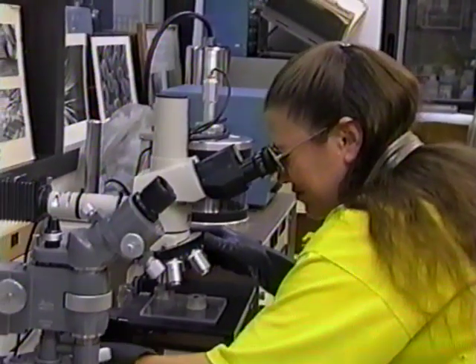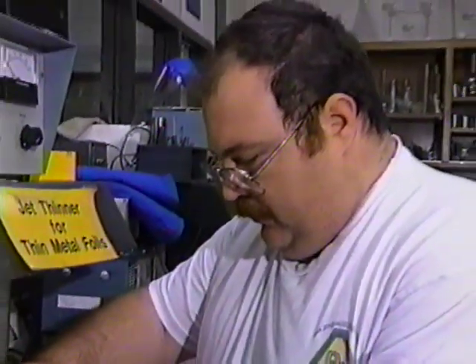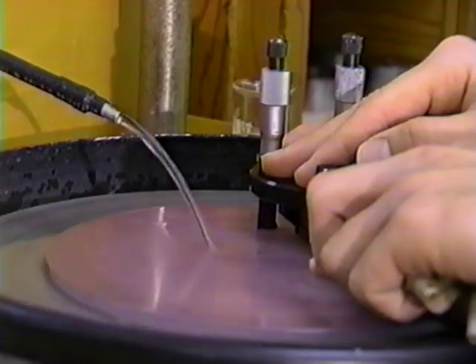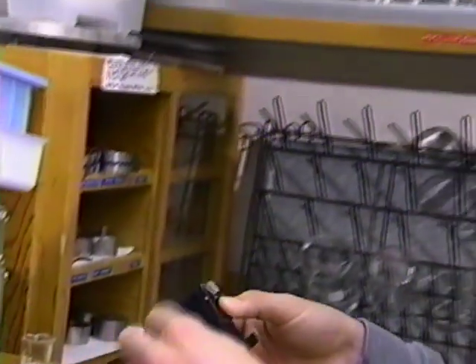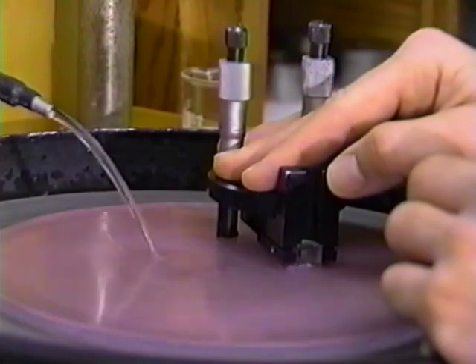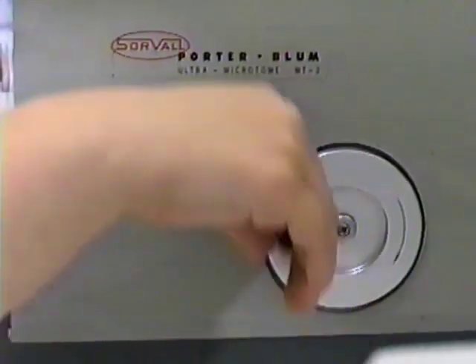Charlotte is looking at an integrated circuit, and before she does the preparation, there we have a student doing thin foiling to make metal foils, and that's polishing integrated circuits so that they can do cross-sections for both scanning and for transmission microscopy to look at where the fault might be. You can see the circuit is on the bottom of that black surface, and then it's being polished.